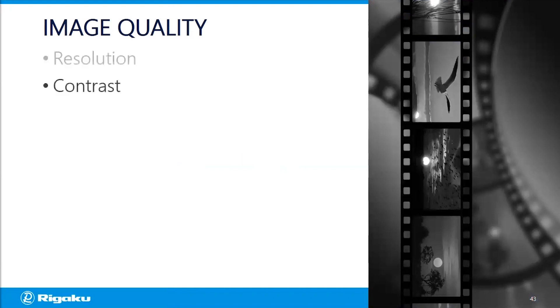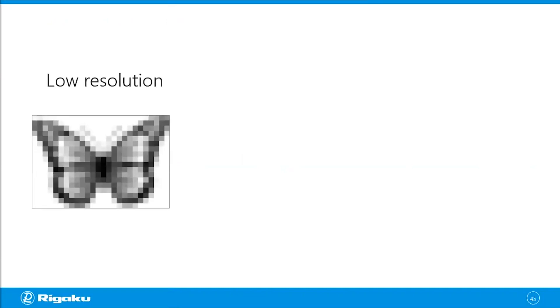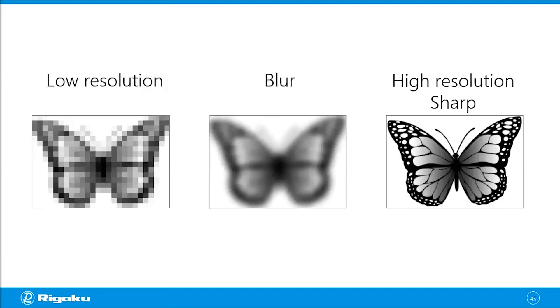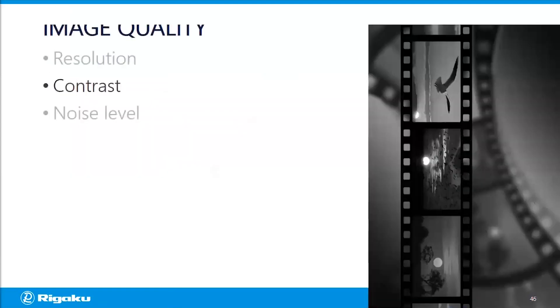Resolution is always important, contrast is also important, and the last one is the noise level. When we say resolution, this term can mean a couple of different things. For example, this is a really low resolution image where the pixel size is way too large compared to the size of the feature you're trying to look at. But what about this image where the pixel size is small enough but the image is blurry? You still can't see what you're trying to see — that's low resolution as well. What you're looking for is a high resolution, sharp image.